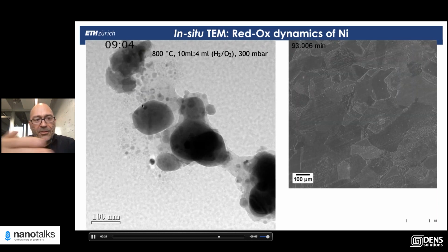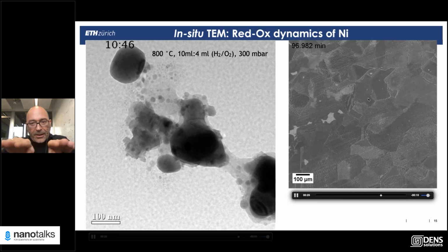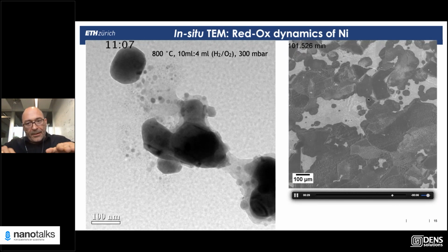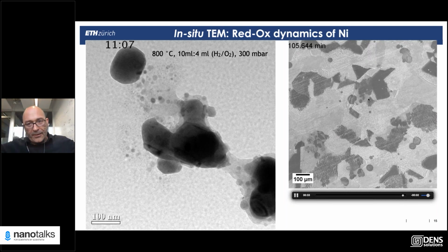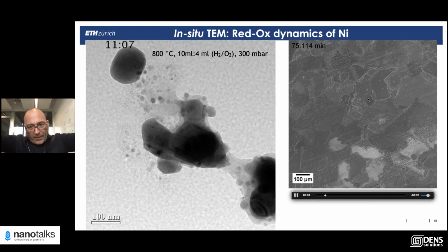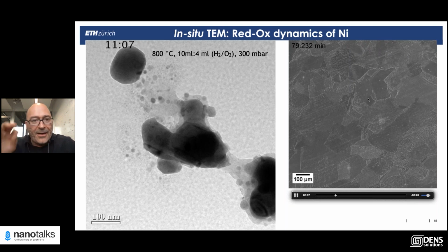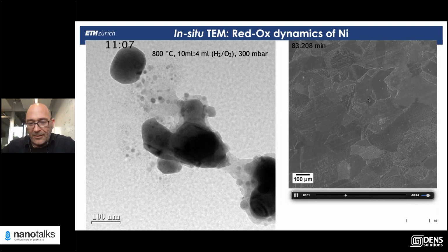The temperature, the contact plays a role, and this we can see on the right side, where the grains are all together in the foil, thermal contact is given. So when some guys get extremely active, they heat up because water formation is exothermal, the heat spreads, and they all get metallic and active. And then there's some mechanism that brings it back into deactivation, it cools down and it gets oxidic. Yeah, it's beautiful to watch, but I still cannot understand everything, so this is still not published.